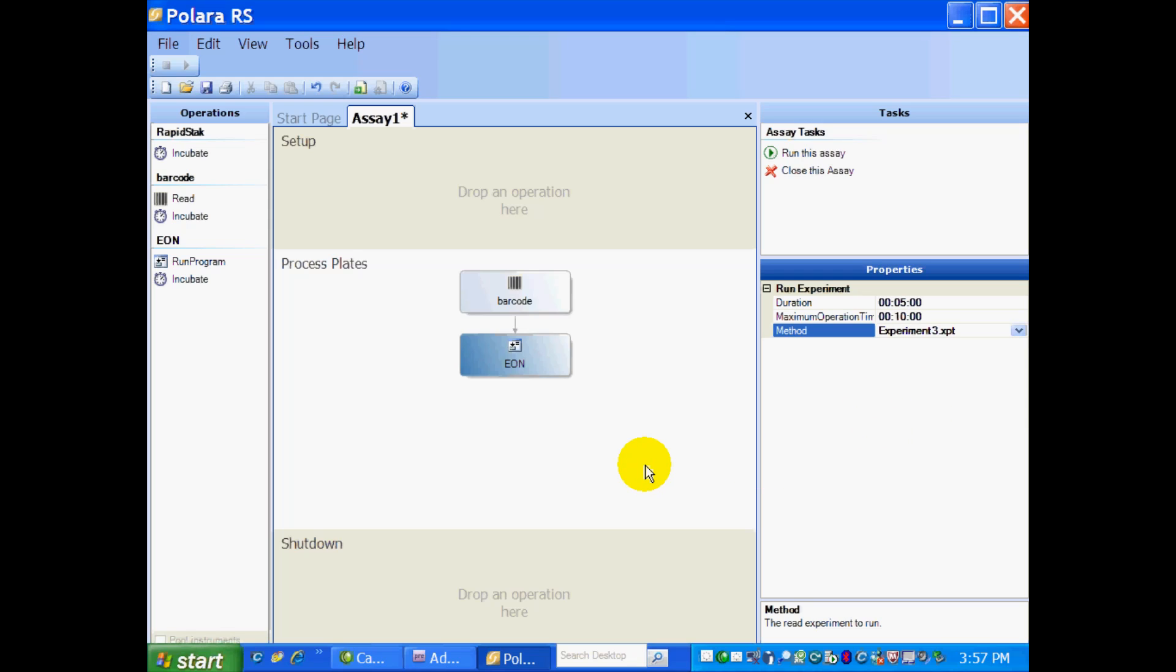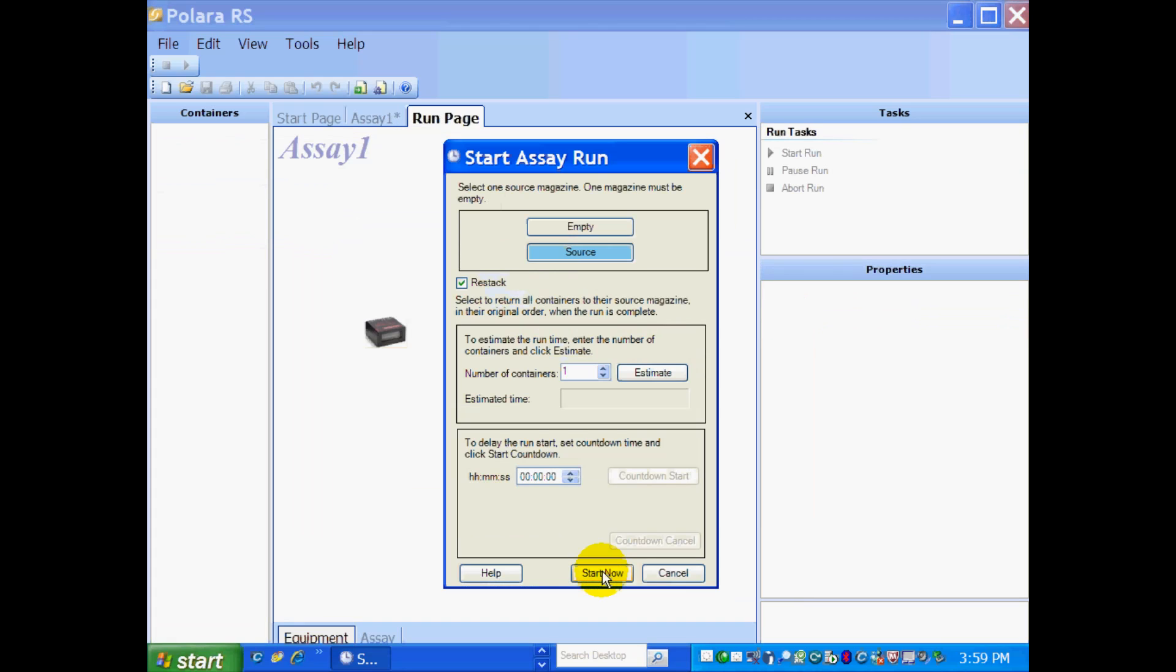And that's basically my process. It's going to read a barcode, send it to the reader, and then store the plate. So all we have to do now is select Run This Assay. On the Start Assay pop-up, I just select where my source plates are. I hit the Restack checkbox, and now all I have to do is select Start Now.